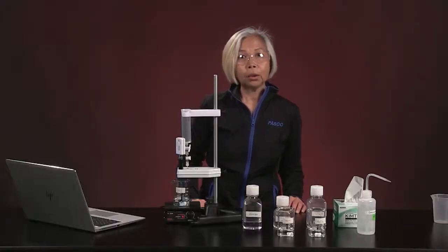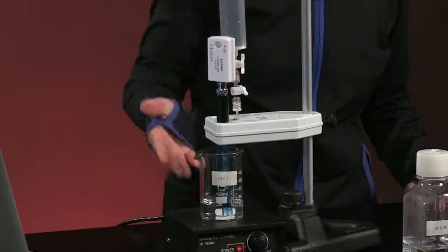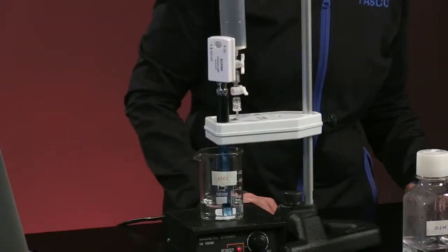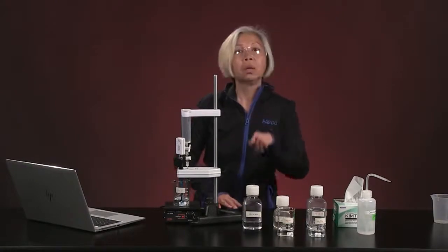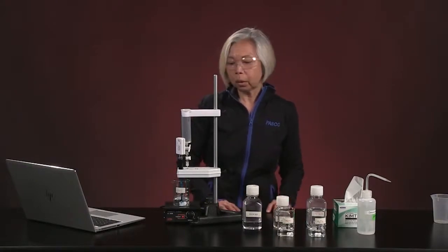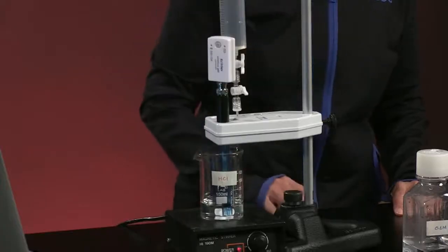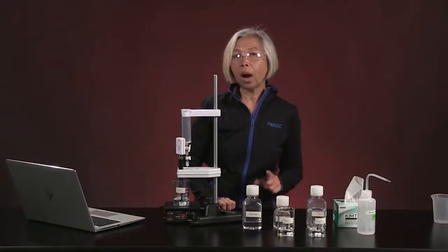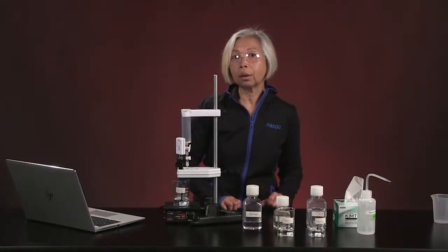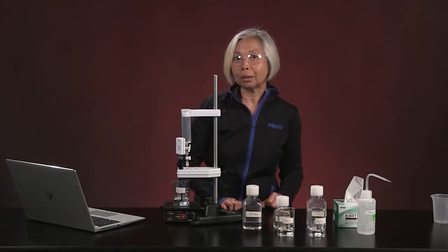We are now ready to do our first titration. We now have a beaker here of hydrochloric acid. Remember that I measured out 10 milliliters of our 0.1 molar hydrochloric acid, and I added some water to make sure that the electrode is properly submerged in it. My quick question to you is, why doesn't it matter that we added water to our hydrochloric acid solution?